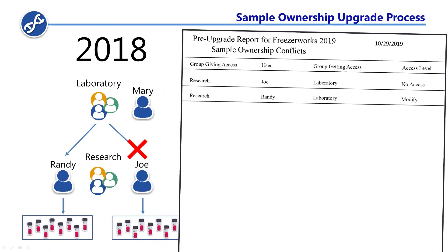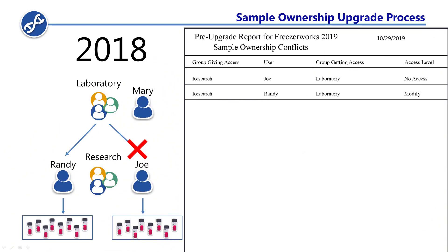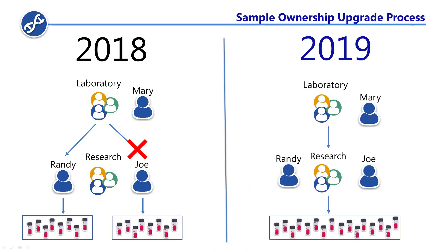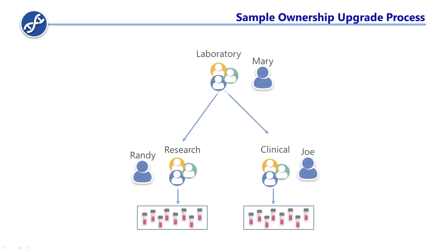During the upgrade, you will receive a pre-upgrade report listing every conflict, so you can return to 2018 and either fix them or plan for the changes. In this previous example, to fix the conflict and maintain the same security, we'd need to create a new group in 2018 that user Joe is a part of.